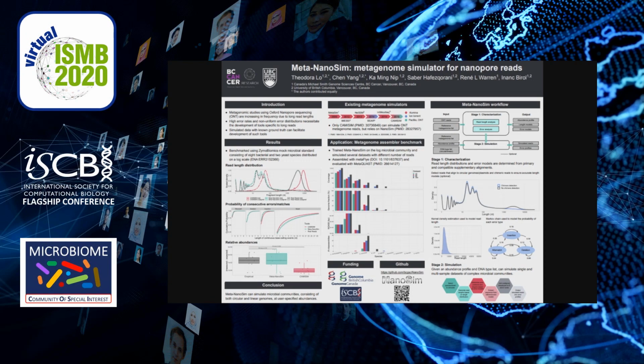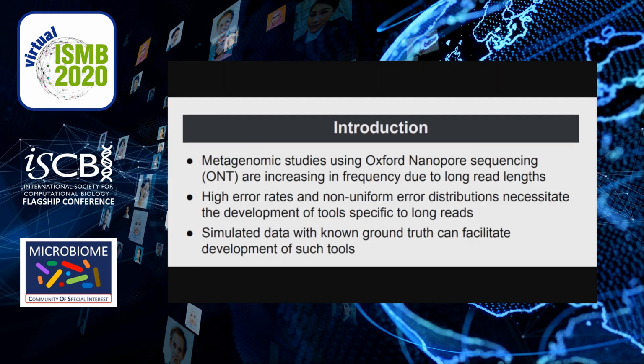Hello, I'm Theodora, and I'm a student in Dr. Inanc Birol's lab at Canada's Michael Smith Genome Sciences Centre. Today I'll be introducing Meta-NanoSim, which is a metagenome simulator for nanopore reads.